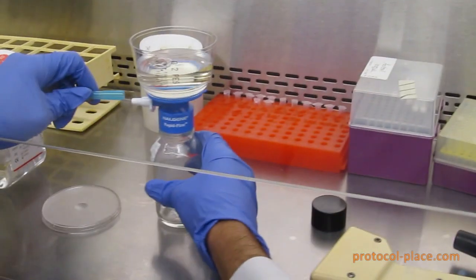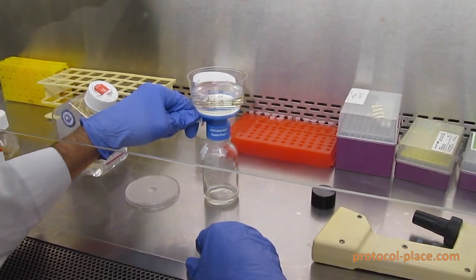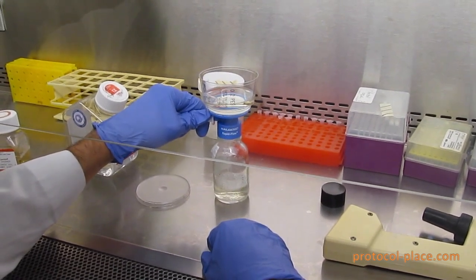Once you are done adding the solution to the top of the filter, you're just going to attach a vacuum to the nozzle on the filter in order to draw the solution through the top of the filter. This is the process that actually sterilizes your solution.